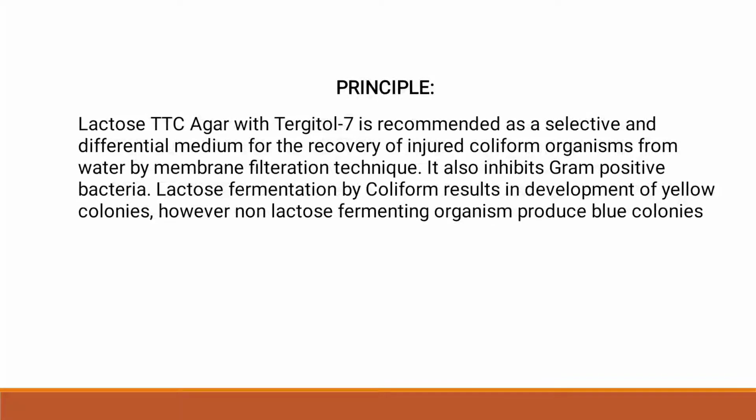So let's move on with the principle. Lactose TTC agar with Tergitol 7 is recommended as a selective and differential medium for the recovery of injured coliform organisms from water by the membrane filtration technique.